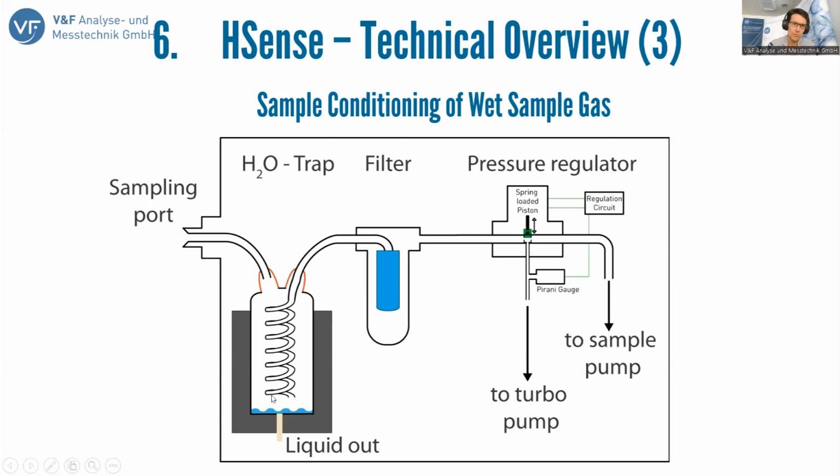It will go through the gas cooling system where the water is removed. Then it will go further on into the filtering system where particles are removed. And then the purified gas is introduced into the vacuum chamber where the analysis will proceed.